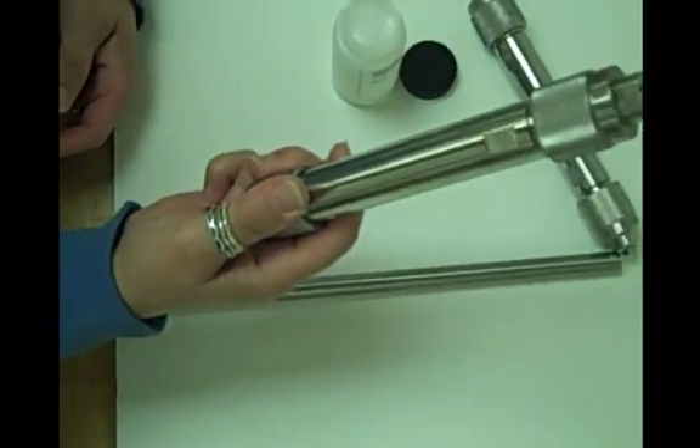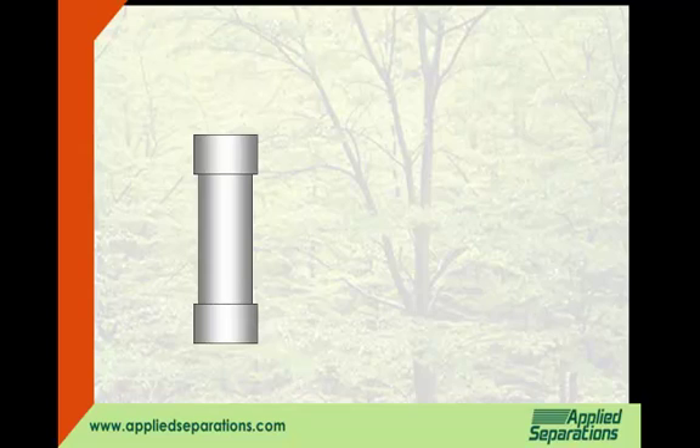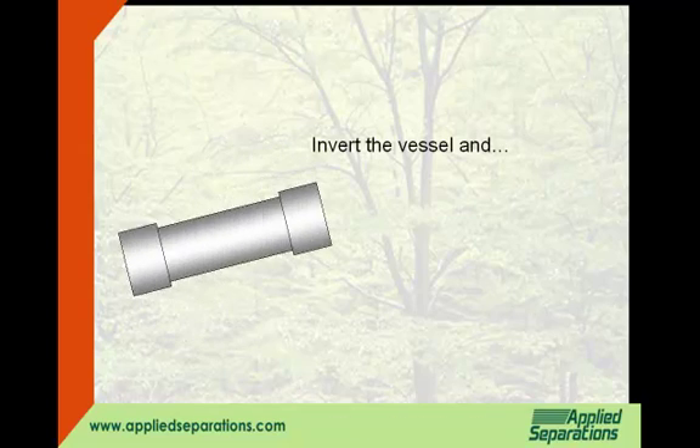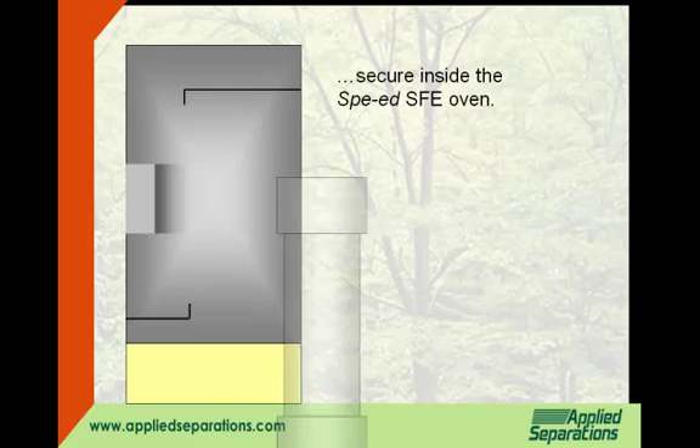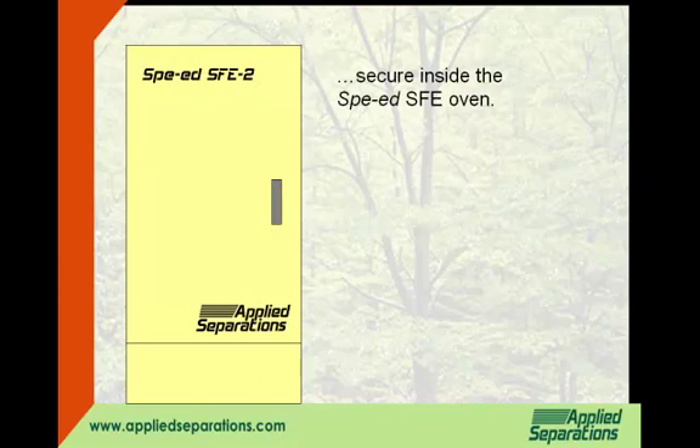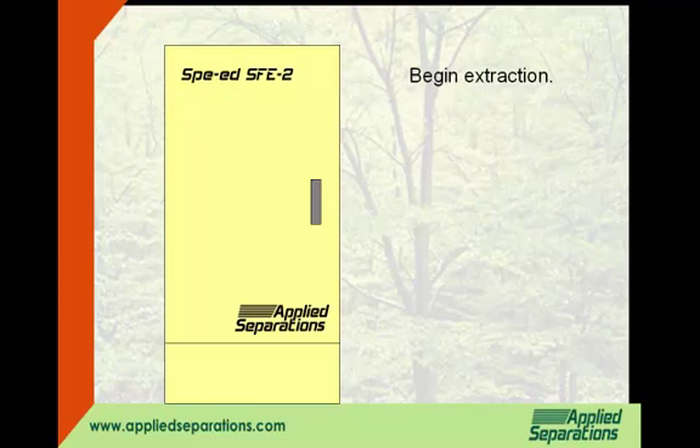Invert the vessel and secure it inside your SFE oven. You are now free to begin your extraction.